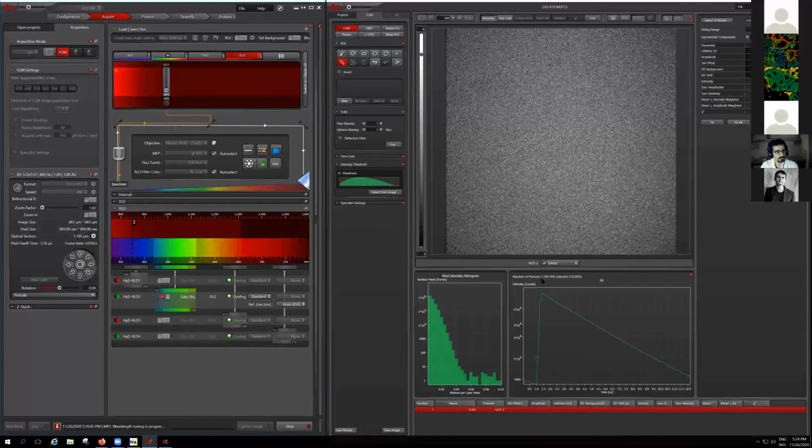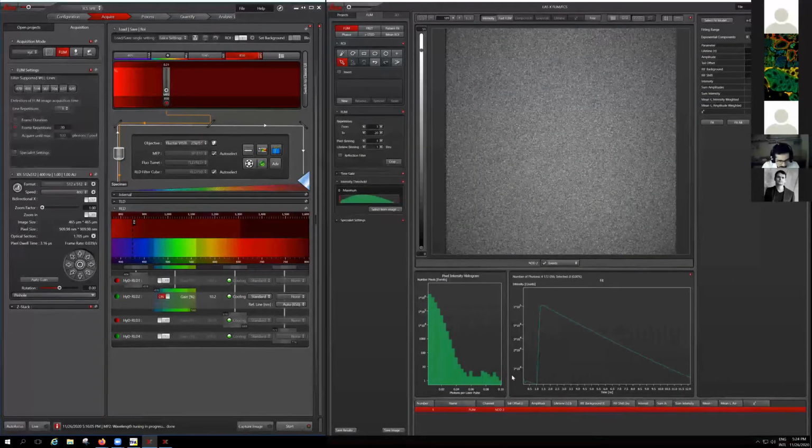It's quite nice counts in the whole. The measurement is not done yet, but we have more than 4 million counts in the decay curve. And again, I'm saying that it's in the whole field of view. That's how this decay curve is shown here. And also what we see here is the number of photons per pulse. The maximum is 10%, so it's every 10 pulses that we acquire 1 photon.